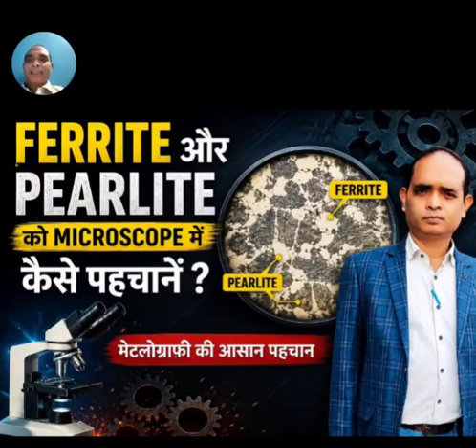Now we are going to explain sample preparation. Before observing the microstructure, the specimen must be prepared carefully. The steps are: cut the specimen, mount it if required, grind using progressively finer abrasive paper, polish until a mirror-like surface is obtained, etch the surface using 2% to 5% nital, wash and dry the specimen. Observe it under the optical microscope. Without proper polishing and etching, ferrite and pearlite cannot be identified clearly.